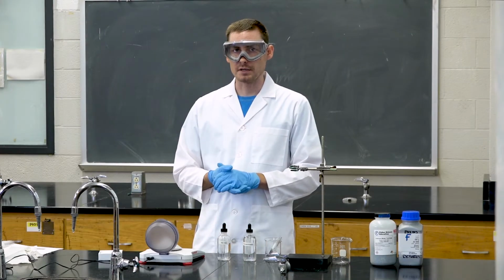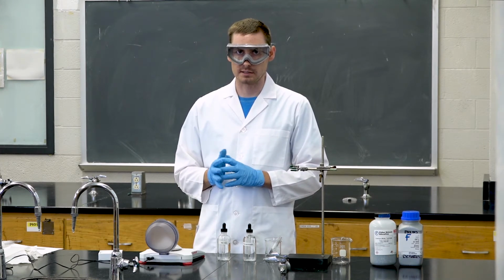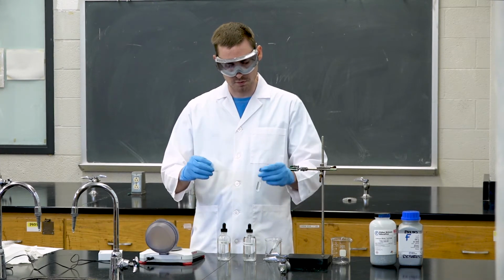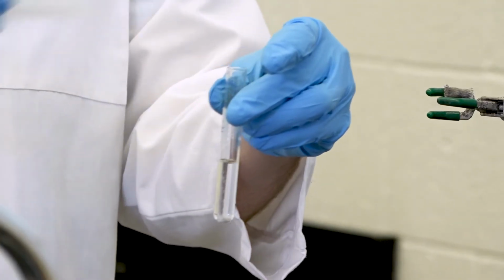So for this part, we're going to need around 0.1 grams of calcium, but you can use less, 0.05. Once you have it weighed out on the balance, you can then add it to your other test tube with water in it and observe the reaction.